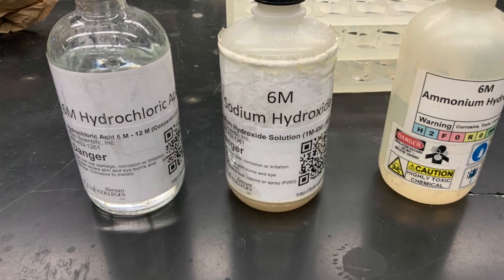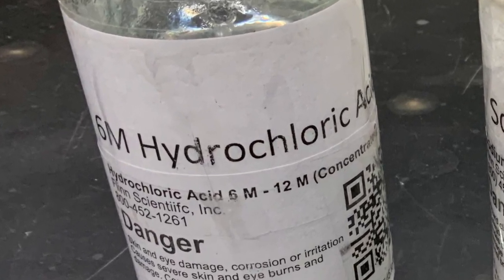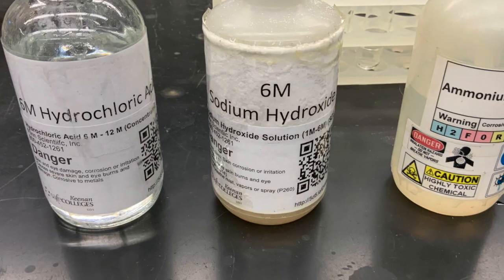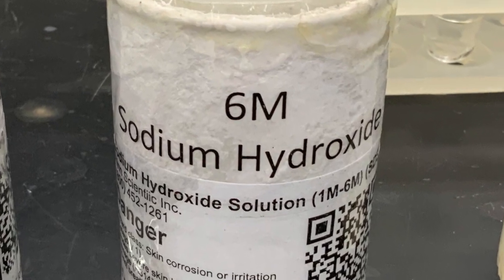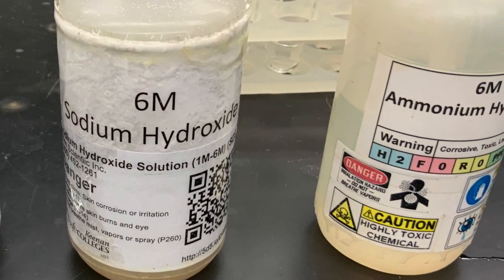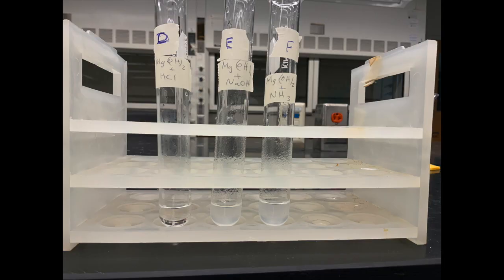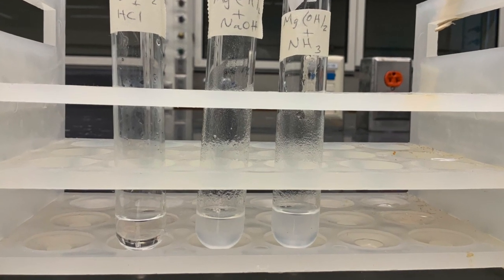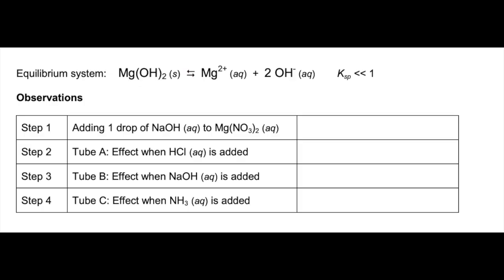To the leftmost test tube, which is tube D, we add 2 drops of 6 molar HCl. To the middle one, which is test tube E, we add 2 drops of 6 molar NaOH. Lastly, to test tube F, the rightmost test tube, we add 2 drops of 6 molar ammonia. We mix the contents and let the solution reach equilibrium. Record what you observe now with the 3 test tubes, D, E, and F. Use these observations to answer the questions in your lab report.